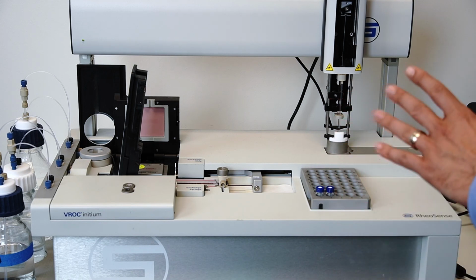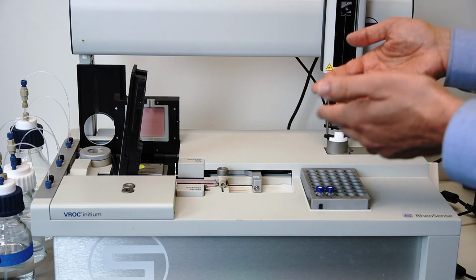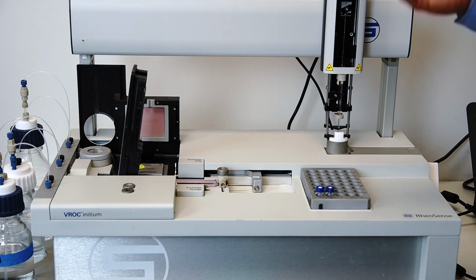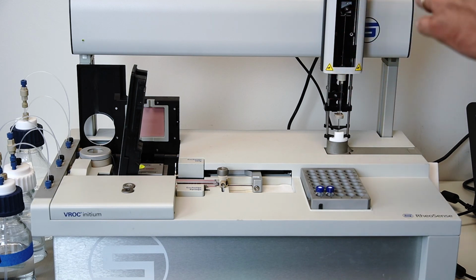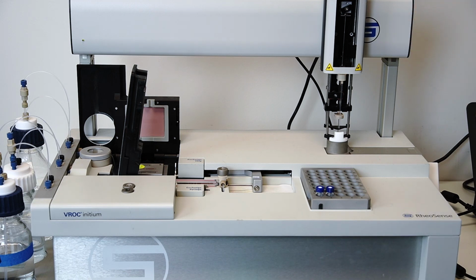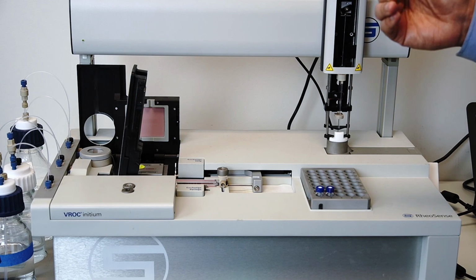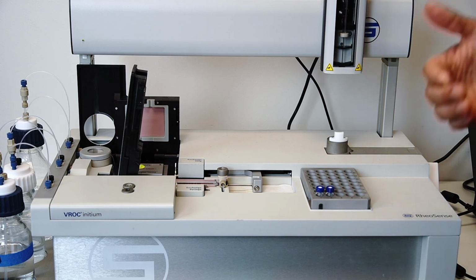And the first segment of any run is called the priming segment, which is just the step where the test syringe and pusher block pushes the sample into the microfluidic chip so that the entirety of the flow channel within the chip is wetted. And so that first segment or that first measurement is always thrown out because it's the priming step of the chip, and so the viscosity measurements aren't at a steady state. So once the first segment is done, then the instrument begins taking viscosity measurements that you can use.